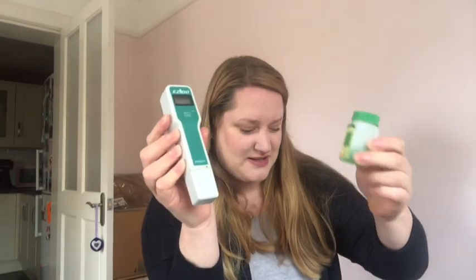There's plenty of ways you can do this. If you were doing this for your coursework, you could use a little testing kit. You can buy individual testing kits in garden centres to test the pH and quality of your soils, or you can get ones like these which are a little more scientific, with solutions that you dilute.